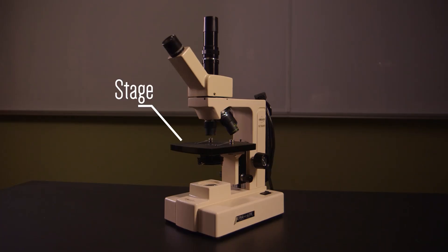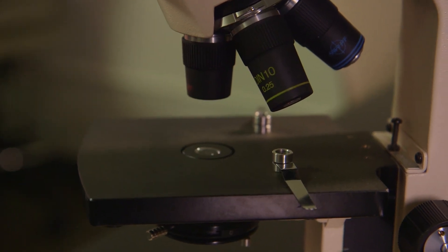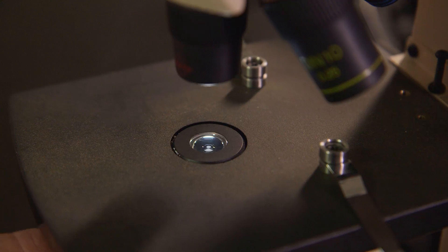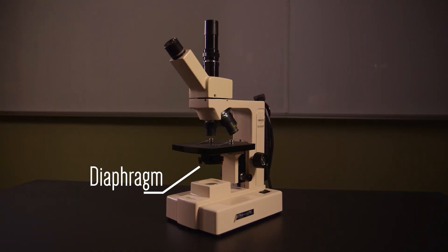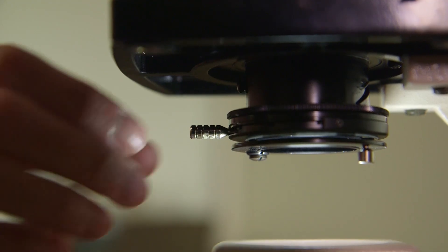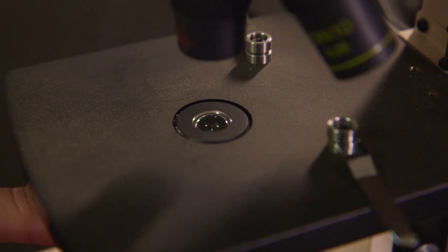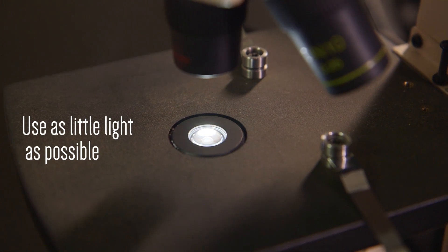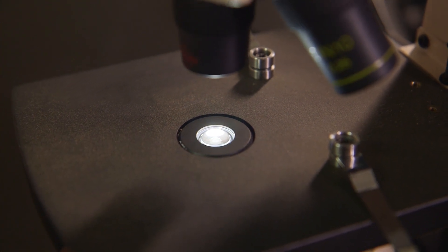You will place specimen slides on the stage. Although you have clips on the stage, you do not need to use them unless you will be moving the microscope with the slide on the stage. The opening in the stage allows light to pass through your specimen. If your slide is too dark and the specimen isn't visible, try adjusting the diaphragm. The diaphragm controls the amount of light coming through the specimen. It is attached to a condenser lens, which should be visible through the opening in the stage. You can adjust the amount of light by moving the diaphragm lever. Use as little light as possible — too much light can wash out or distort your specimen. The right amount of light improves the clarity of the specimen.